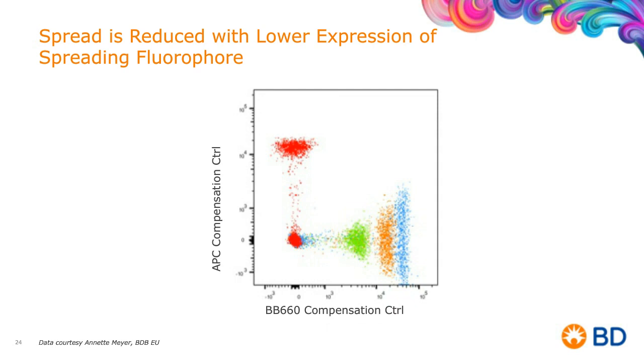Now, we can't do this with everyone because we do need saturation, because many receptors are upregulated, and we need the maximum separation because maybe the resolution is not that big. But this is a critical component here of understanding the impact of the expression number of receptors to a color.